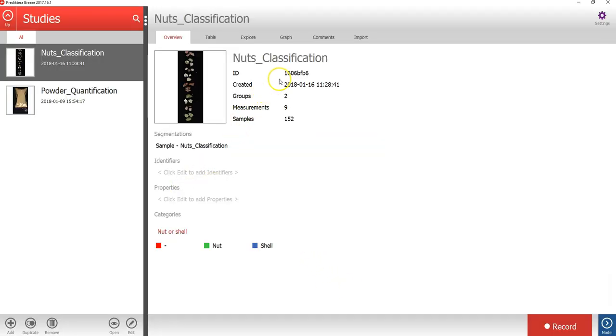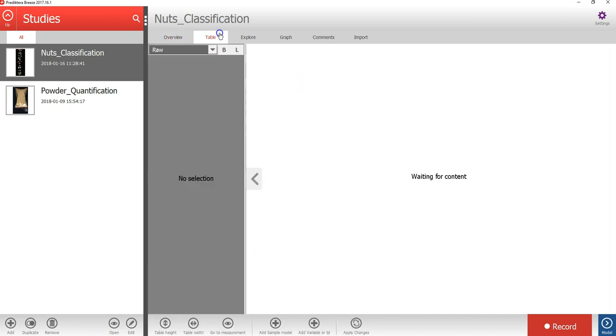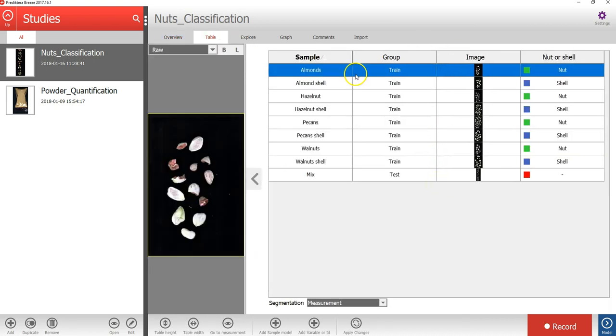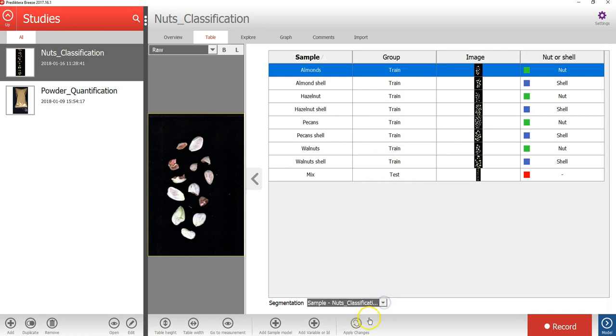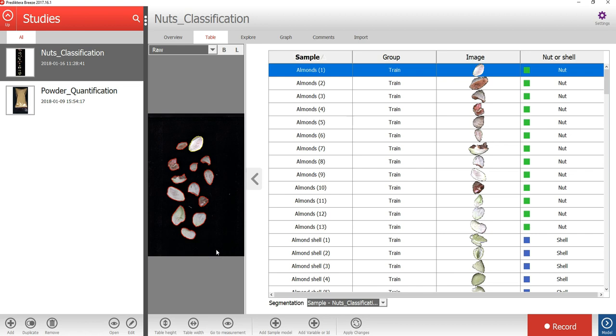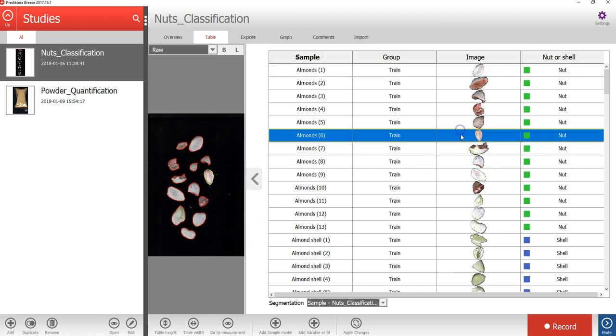In the nuts classification study, we have nine images where we had already set the class nut or shell. If we change the segmentation level in the menu under the table, we can see that we have removed the background and identify the sample objects in all these images.